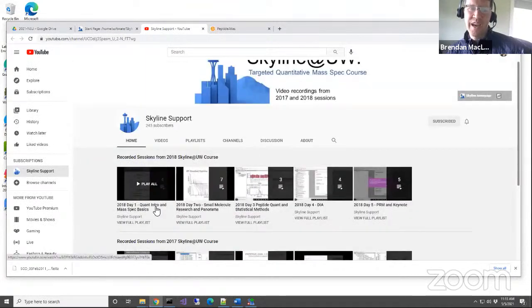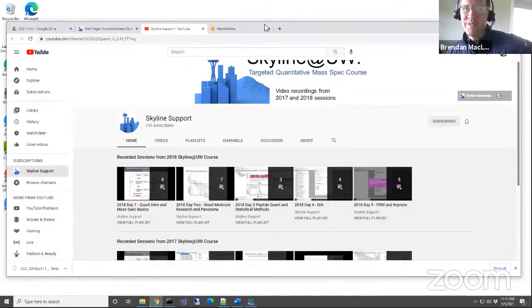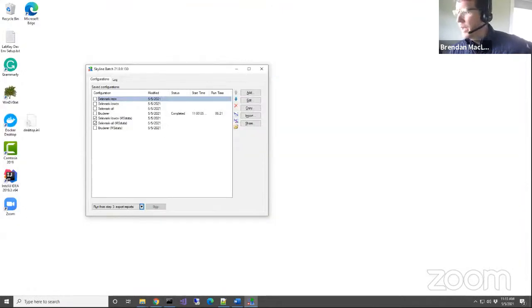If you're like, wow, that went too far ahead for me, I would like to go day 1, mass spec basics, day 2, you could maybe just do the first 2 days of the 2018 course, and that might give you a lot more perspective.